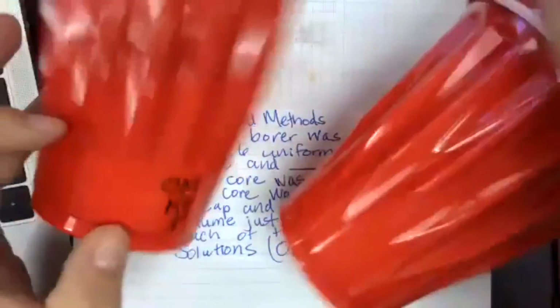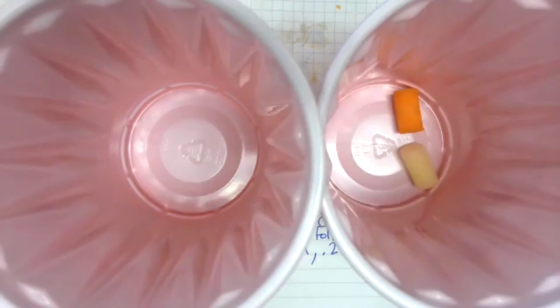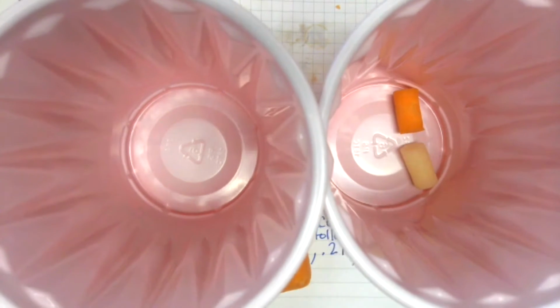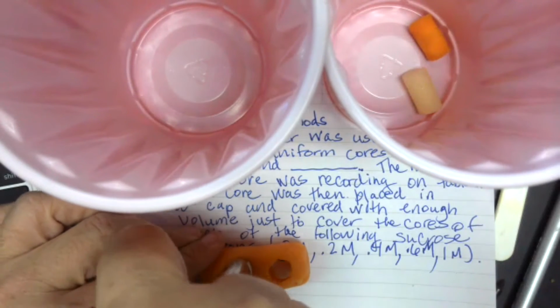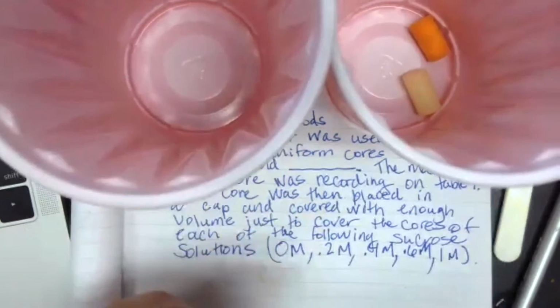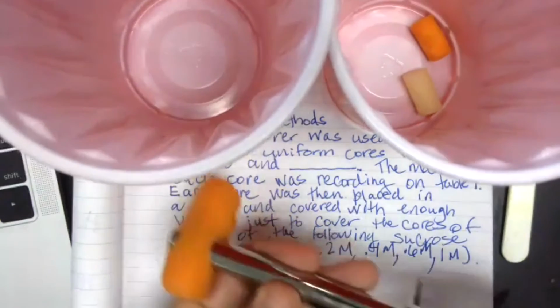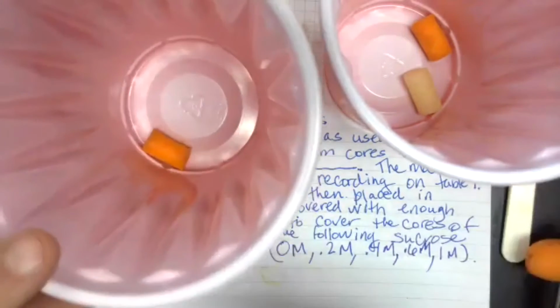All right. So I have 2 molars set up here already, or 2 different solutions. I have my cores, so I'm going to go ahead and put my cores in here. A picture is worth 1,000 words. Let me get another core of my carrot. Careful not to use that by your fingers. And then you just use the non-sharp end of your needle. And now I have my other 2 cores.